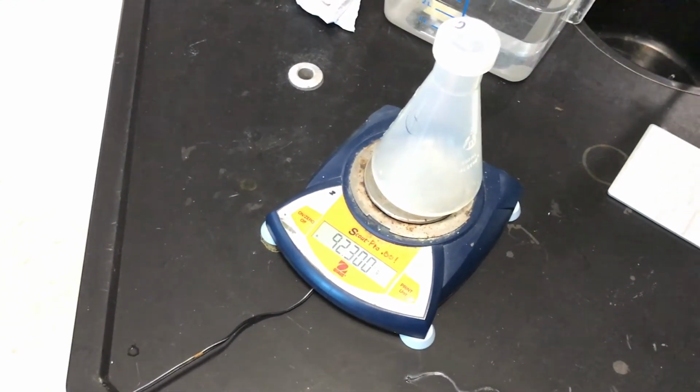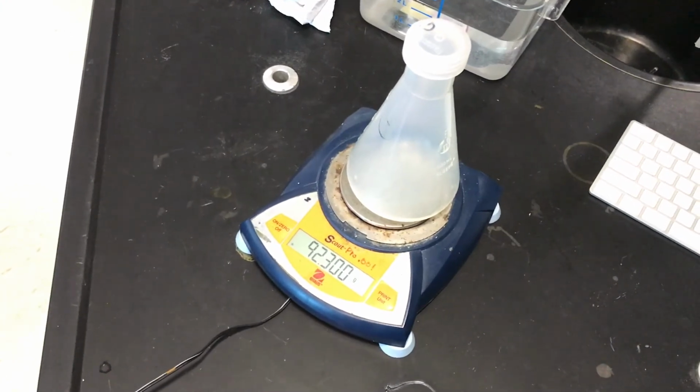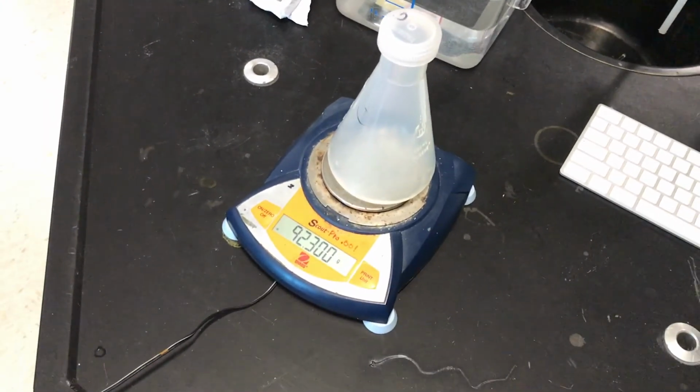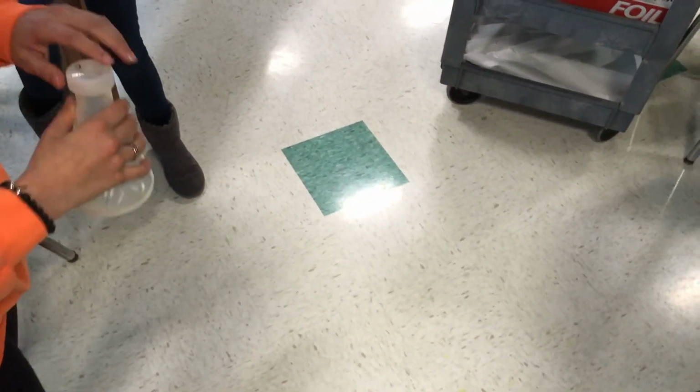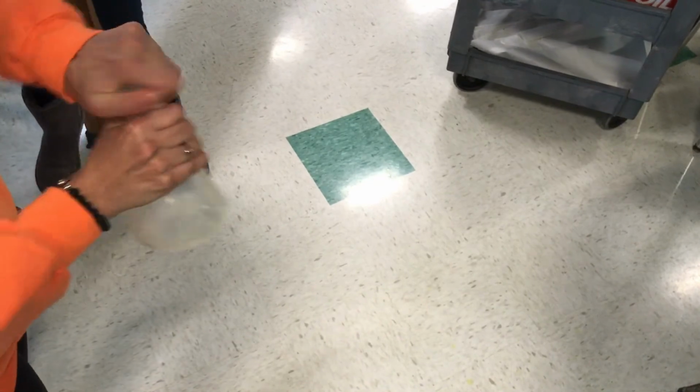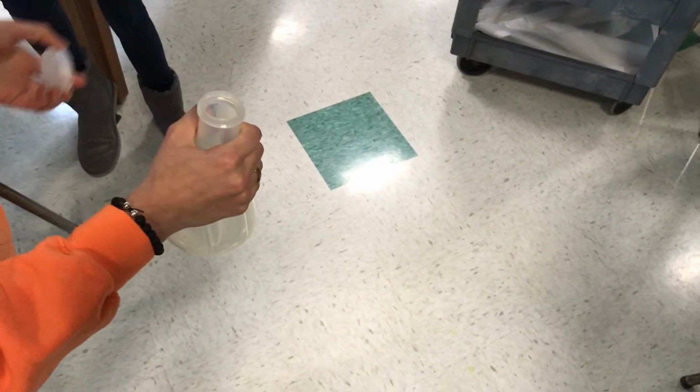But before we do any of that, let's grab this flask. Now all I want you to do here is unscrew the top. Like with it upside down? Yep, because I want the helium gone. That was helium. Let it go. Helium's gone. Now kind of shake it all about. Good. Now air is in there.